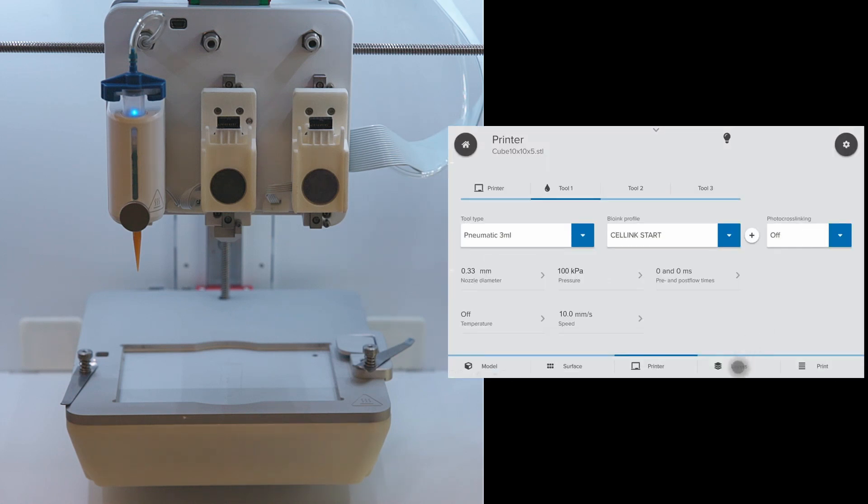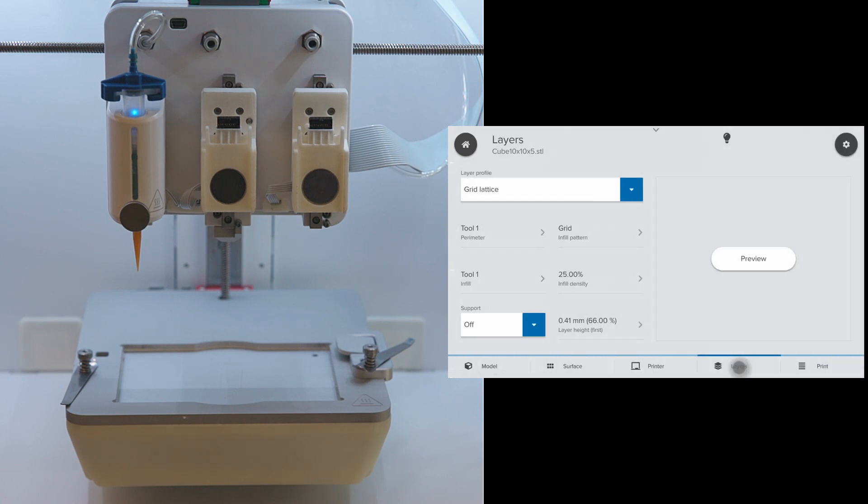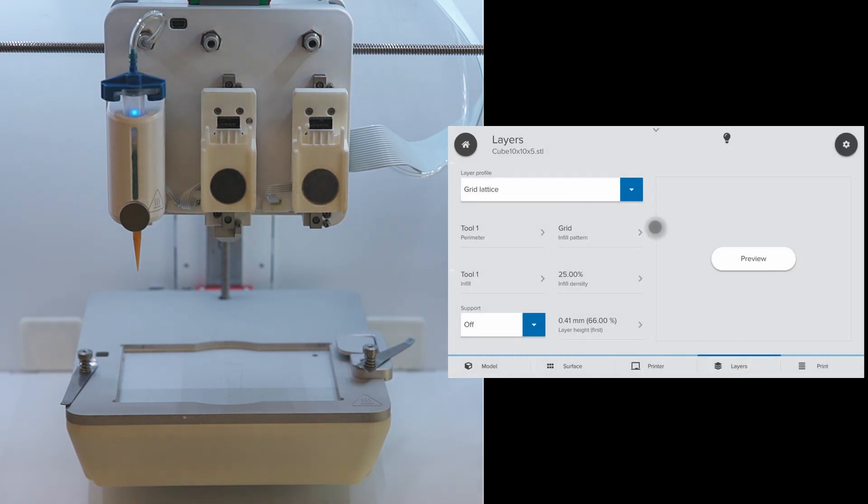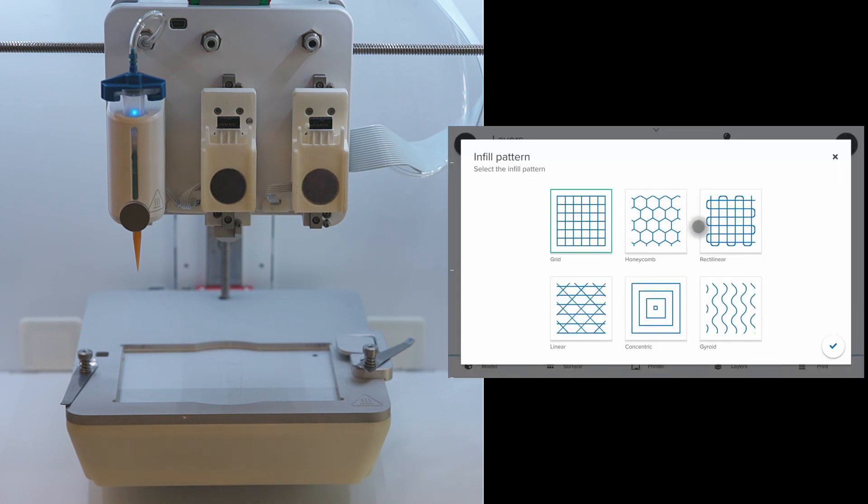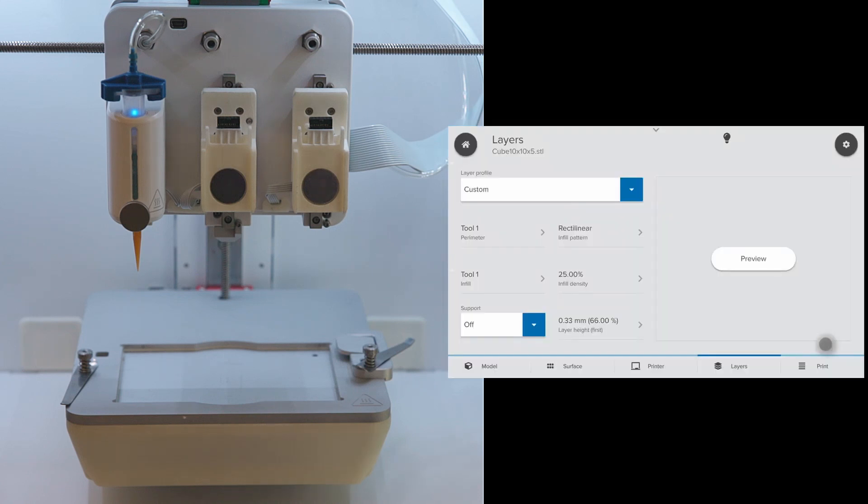After optimizing the printing parameters, we go to the next tab, Layers. Here, we can choose from different infill patterns. Here, I'll be choosing the grid lattice. We have options for perimeter and tool for infill. I'll be choosing rectilinear path and click OK. The infill density can be modified as needed. Next, click on preview to look at the layers.